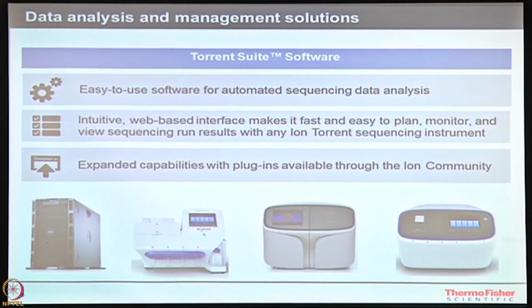So as I come back to what I was speaking, you have done data analysis onto a reference genome, aligning your data to that reference, but you need to know something more about it, whether it is actually representing your data or not, whether it is actually aligning to your regions of interest or not, right? So that's my main important point.